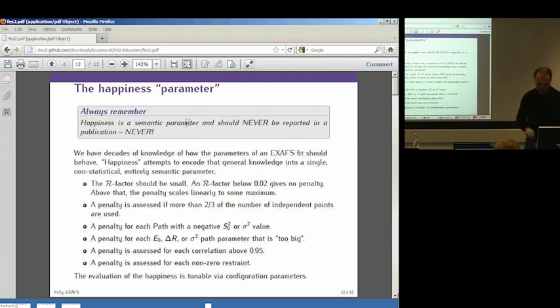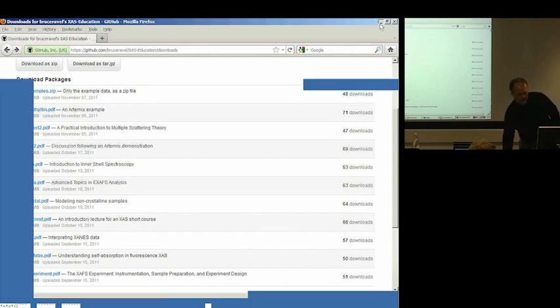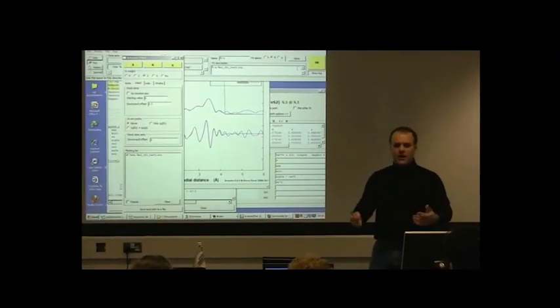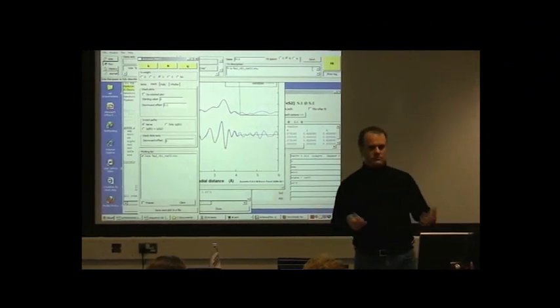and something else that I haven't talked about yet, but we'll talk about later. What I recommend is that you grab a copy of that talk and have it with you if you go and try to reproduce all of this work. I'd recommend having a copy of that talk because it talks about several of the points that I haven't gotten to because I had to talk about all the other things.